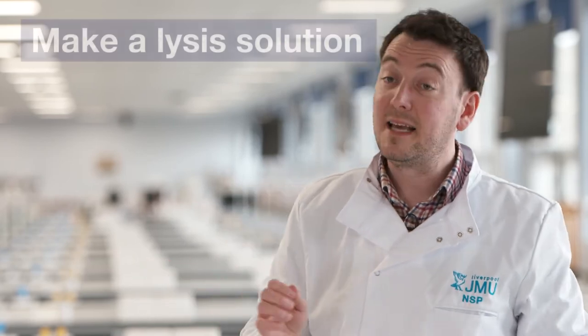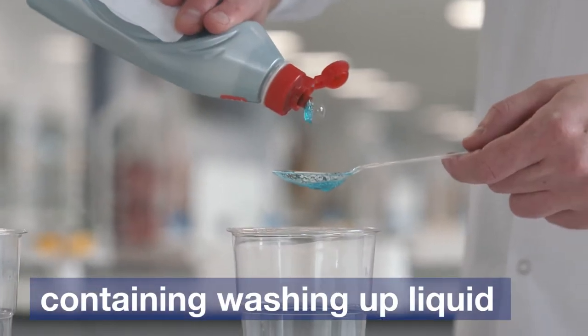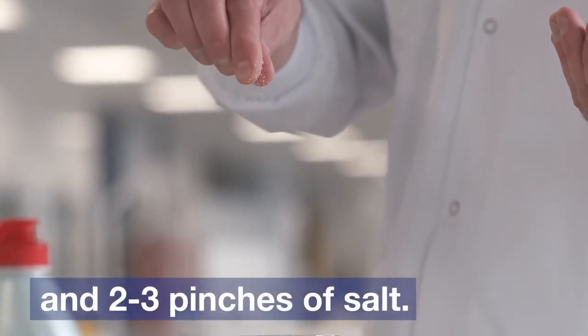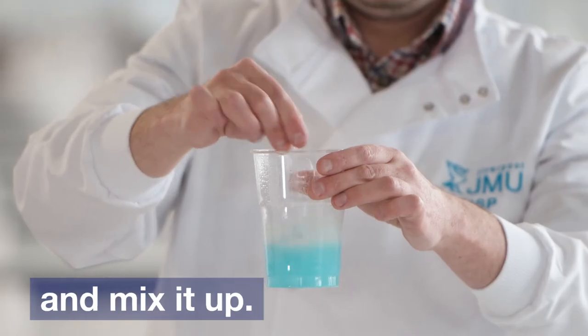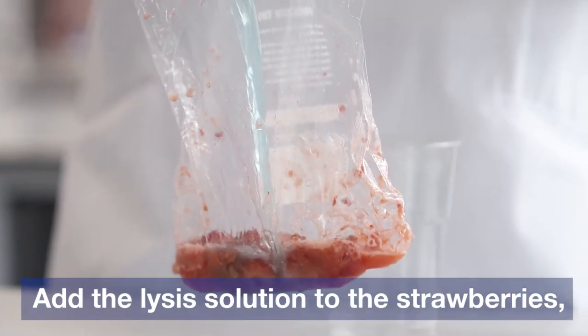We have to make a lysis solution, which contains washing up liquid and two to three pinches of salt. Then we add a bit of water, mix it together, and then add our lysis solution to the bag.